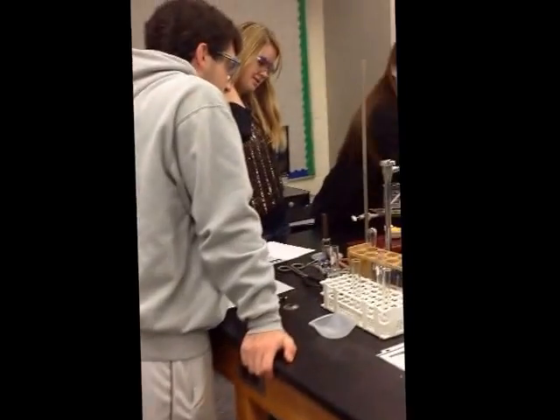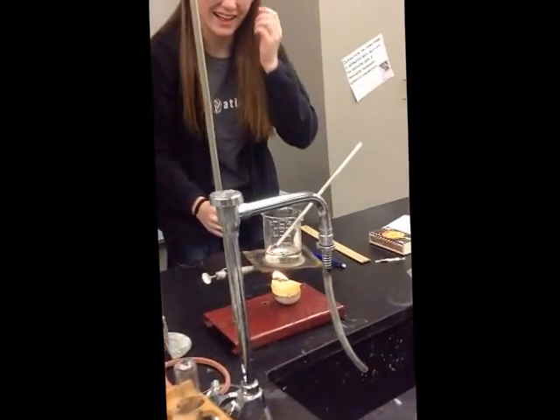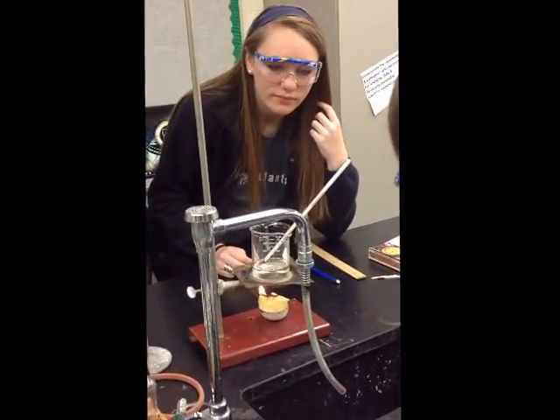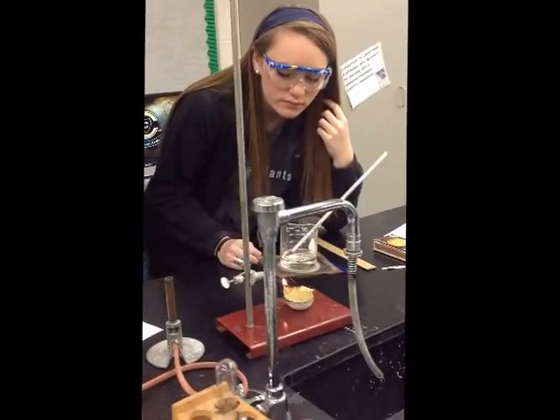Let's see how the other lab groups are doing. Wow, back here, Abby's got quite the flame going. I hope that Jake doesn't flip his pen into the flame. Almost did. You can see that this lab group is also measuring the temperature of their water and trying to find out how much energy that potato chip is giving off. Nice job, lab group 3.